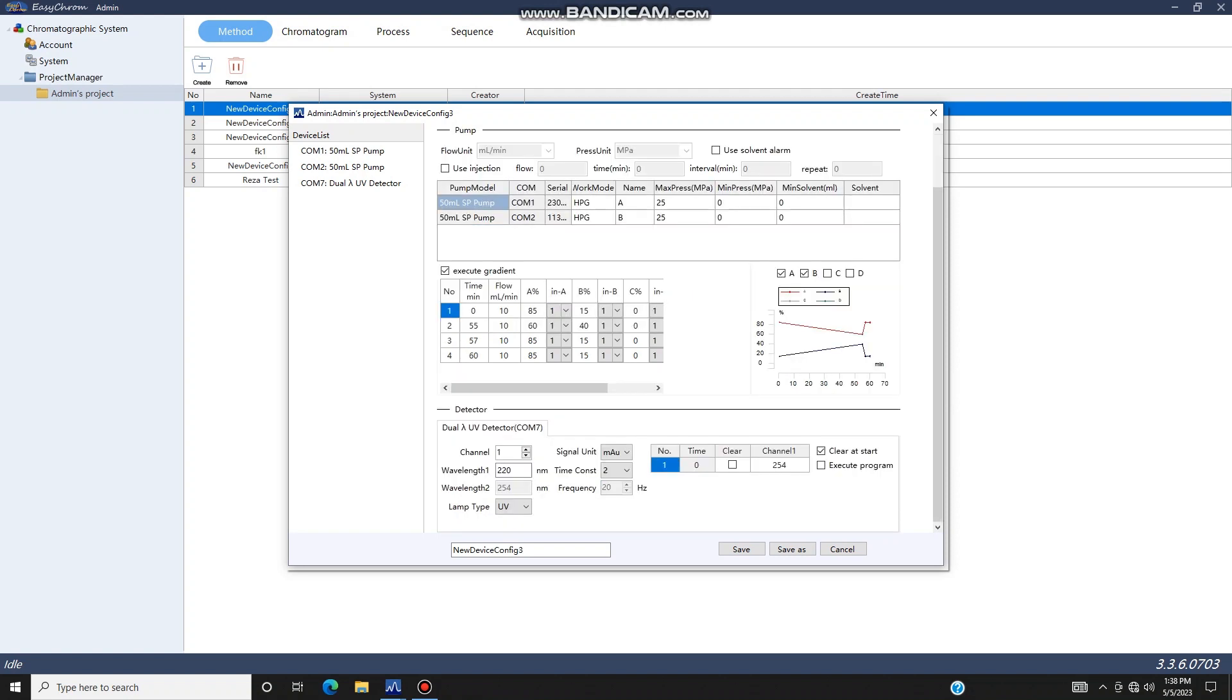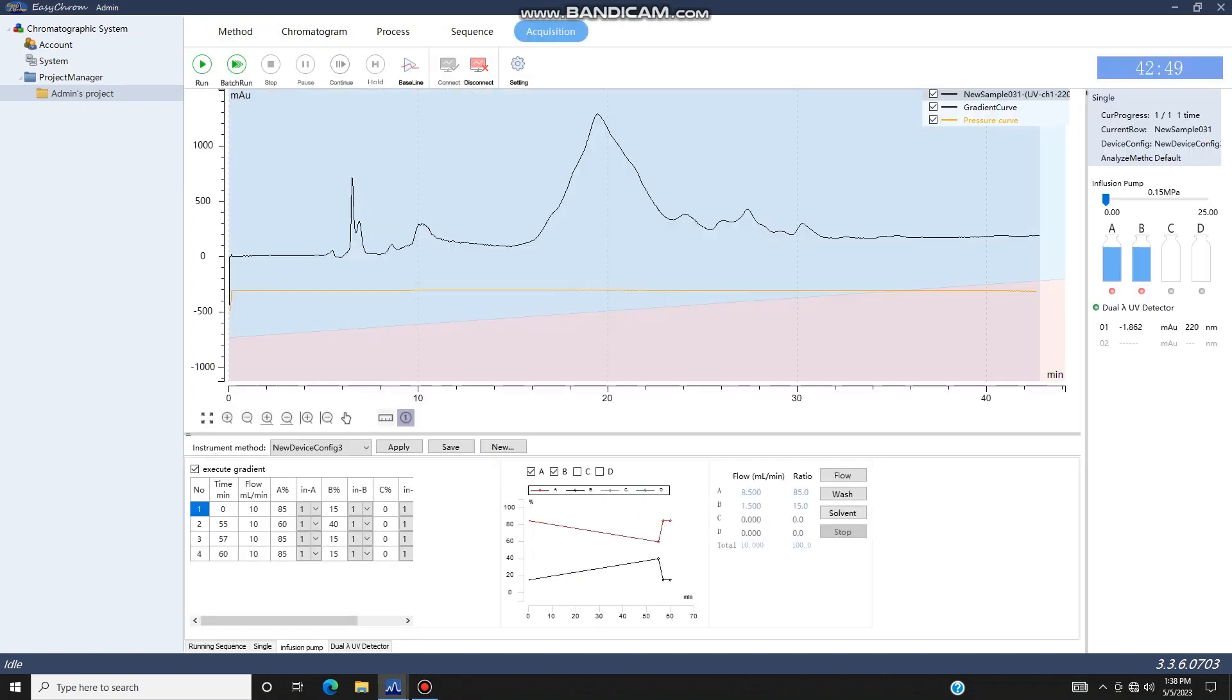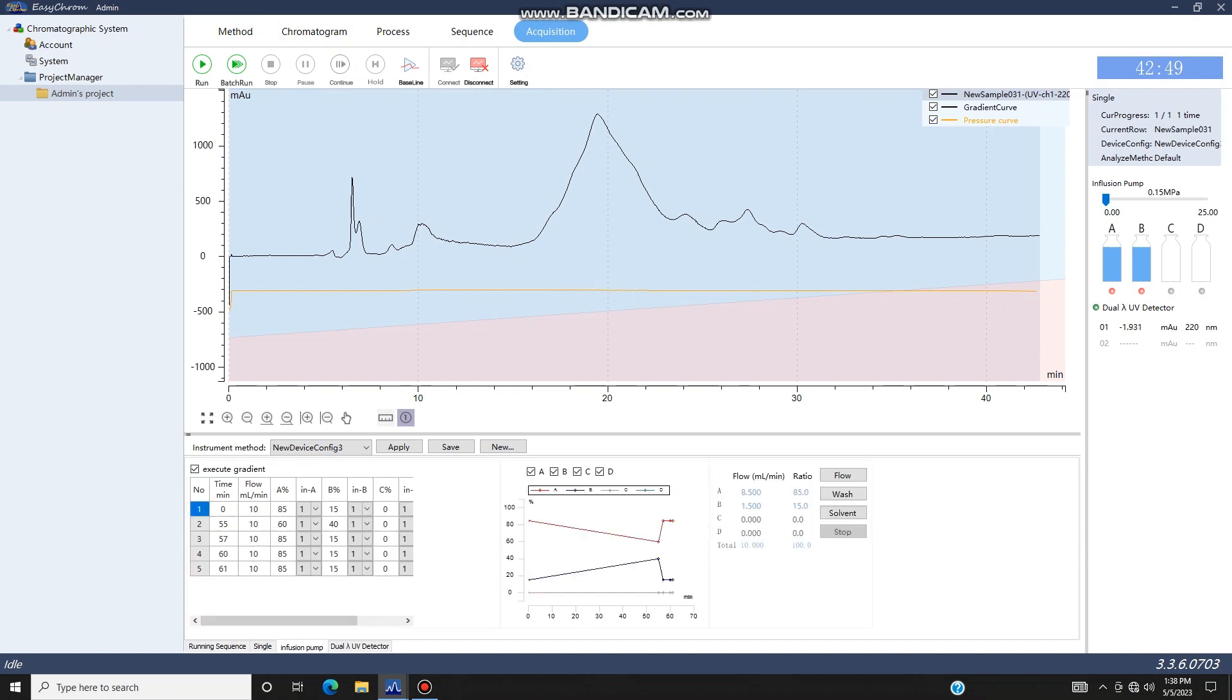If you would like to rename the gradient, click Save As and give it a new name. If you would like to set up a new gradient, go to the Acquisition menu and select the Infusion Pump tab at the bottom. Right click to add a line and enter your Pump A gradient percentage. Then adjust your flow percentage for solvent B.